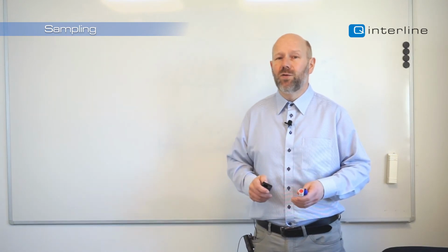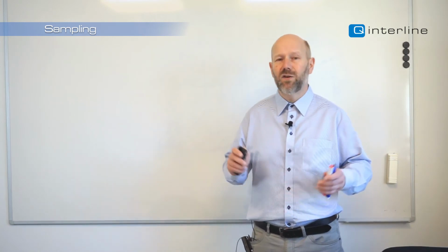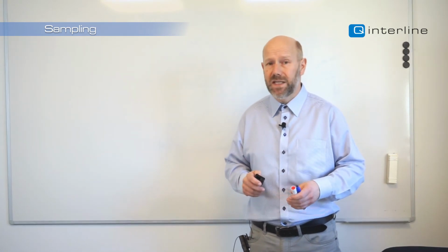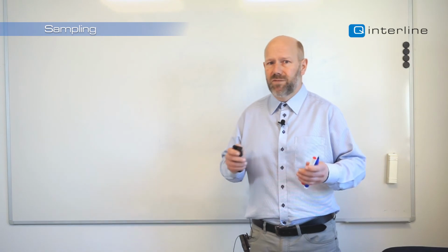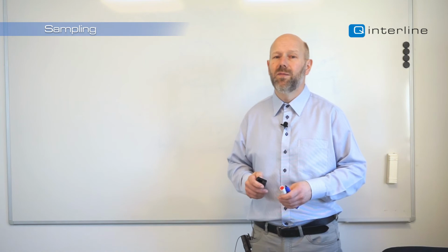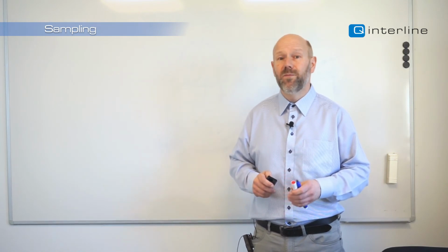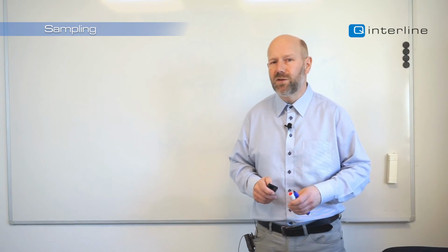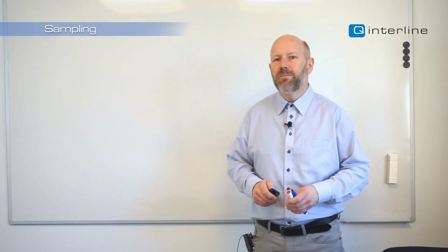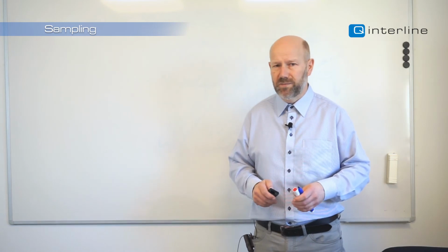The prediction model simply involved a small CH region, because the spectra of these two plastics are very easy to model. And with a simple Savitzky-Golay pre-processing, we could make a very nice model. But when it came to prediction, the results were quite different. Let's look a little bit into the results of the first experiment.